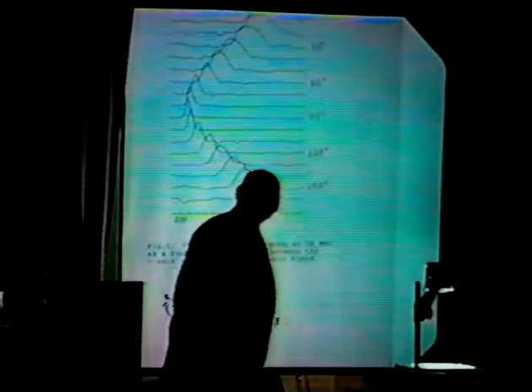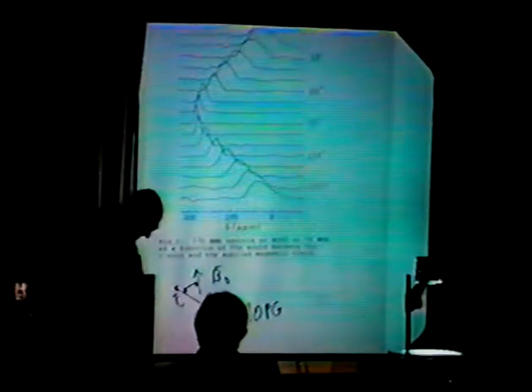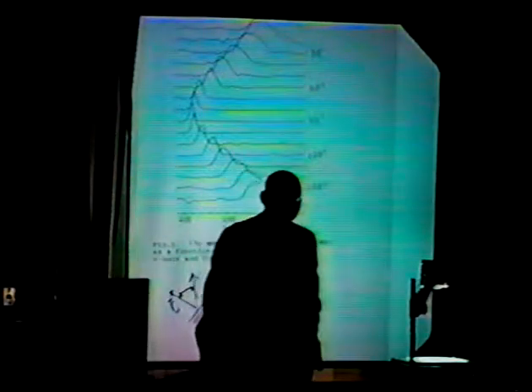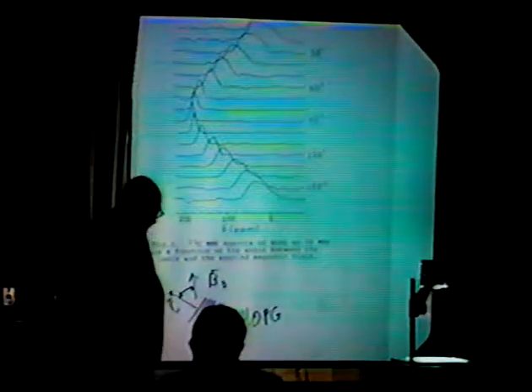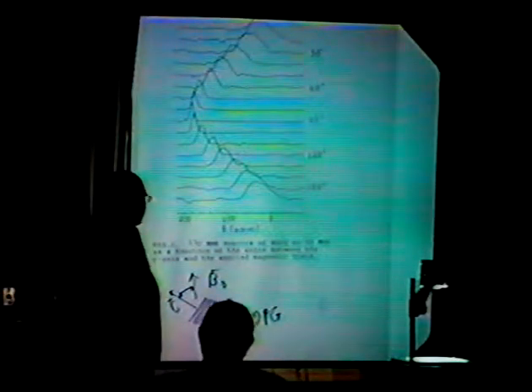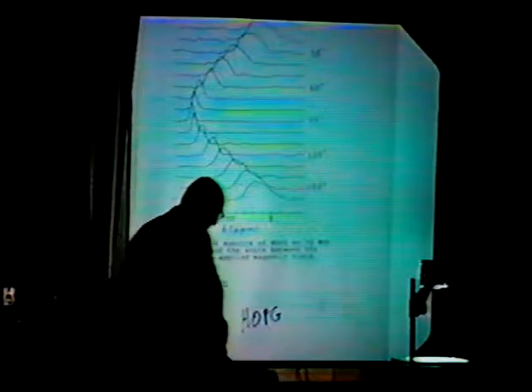Now we are able to obtain from Union Carbide a sample called highly ordered pyrolytic graphite. This is made by the pyrolysis of methane on an iron surface, and it's then pressed, and it's well ordered with the C-axis of the graphite.